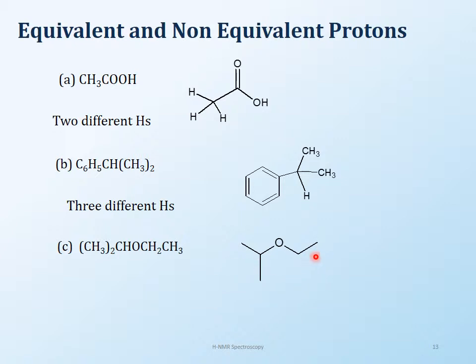Now, just because you have a CH3 over here and CH3s over here does not mean they're going to be the same. Okay, these CH3s are separated by a CH, whereas these CH3s are separated by a CH2. So you will see 2 different CH3s. They may be close to each other, but they're not going to be the same. They're not what we call equivalent, and we don't call them equivalent, again, remember, because if you switch them with a halogen, you will get a different compound. Okay, that is why they're not considered to be equivalent.